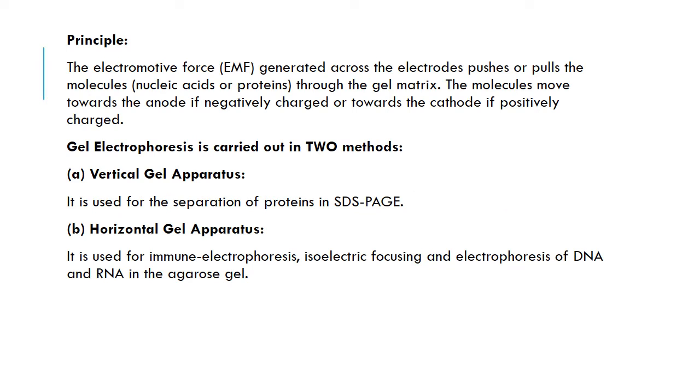Now, gel electrophoresis has a principle under which it works. The principle of electrophoresis is based on the electromotive force, the EMF. The electromotive force is generated across the electrodes. As we go on, we are going to see a diagrammatic presentation of how that happens. It is generated across the electrodes, and it pushes or pulls the molecules through the gel.